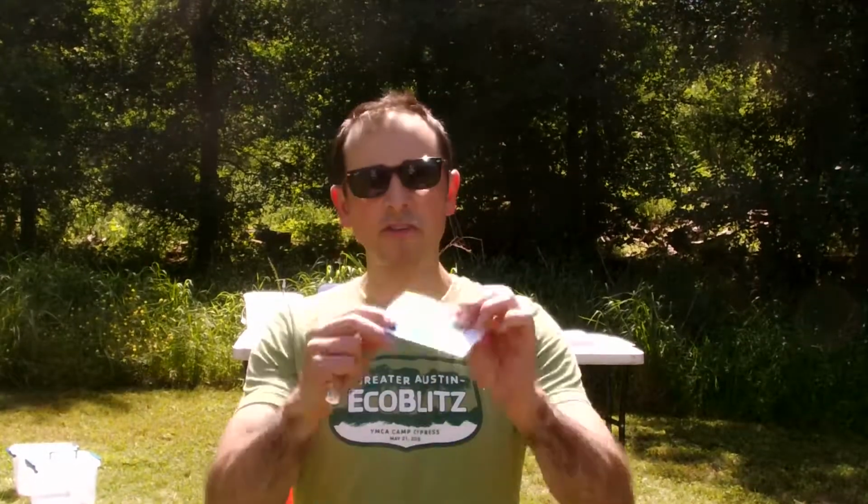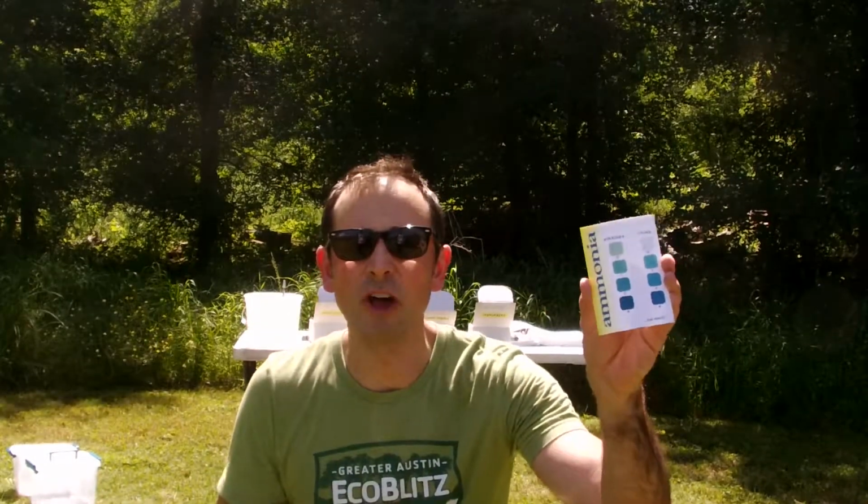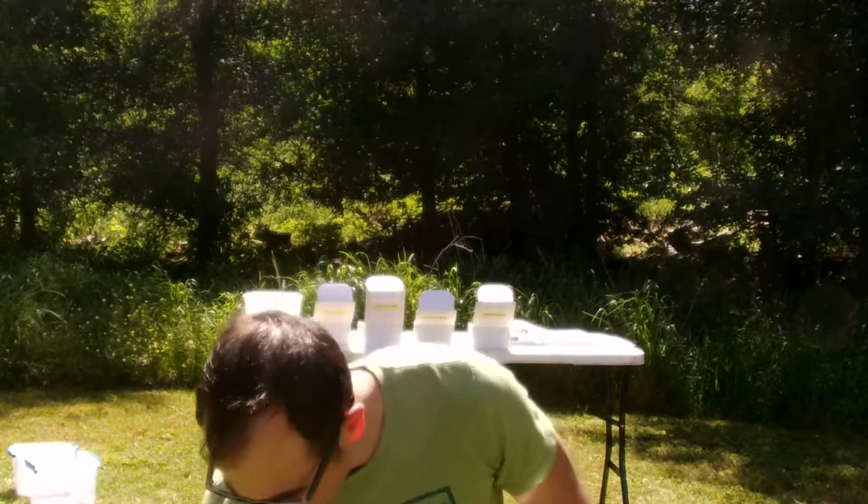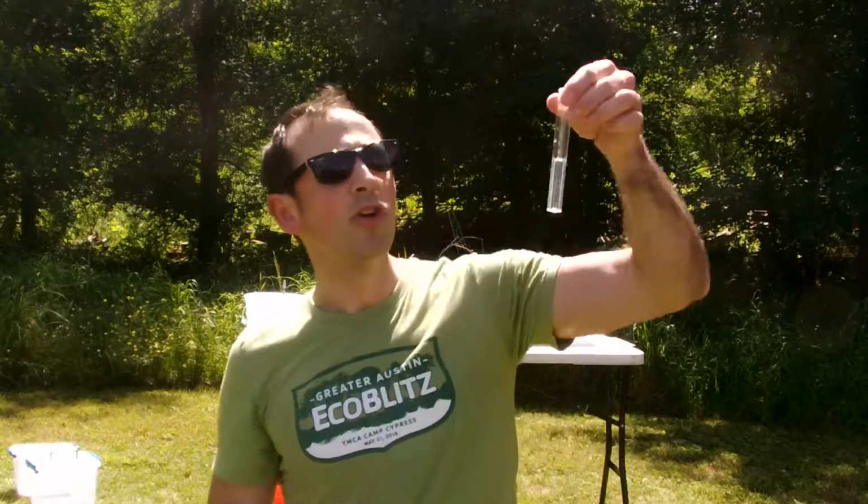Similar to the other ones, you also have your color chart, okay? On this one, be aware there's fresh and salt water, so make sure you go to the fresh side, not the salt water side. This one has 2 tablets, a 1 and a 2, so 1 goes first, right? Your water sample in this one is going to be 5 ml, okay? So make sure you're using your bucket full of water there. You're going to pop your tab in.